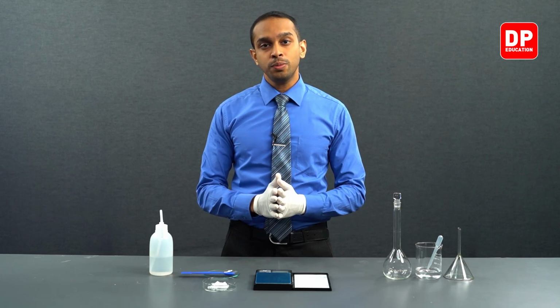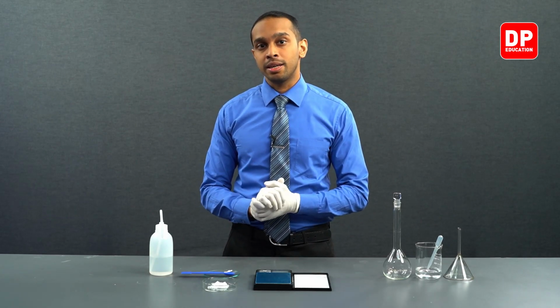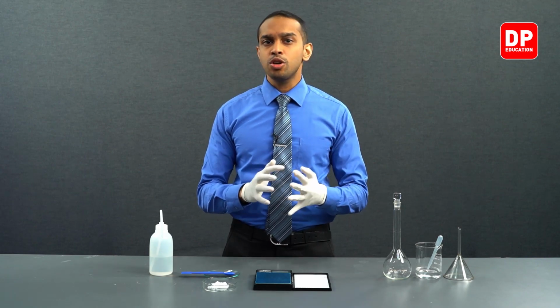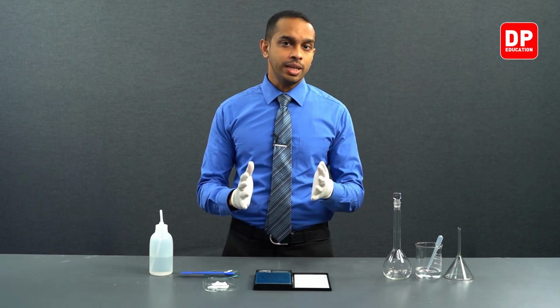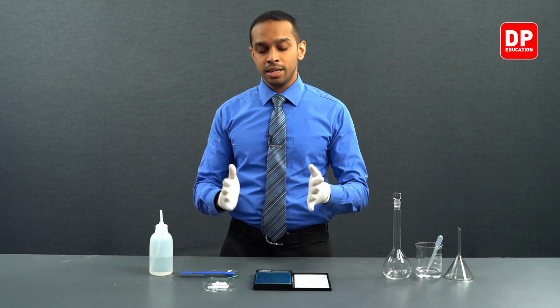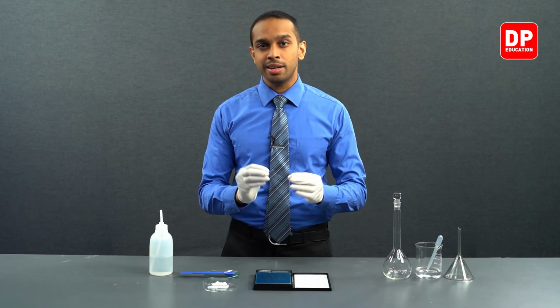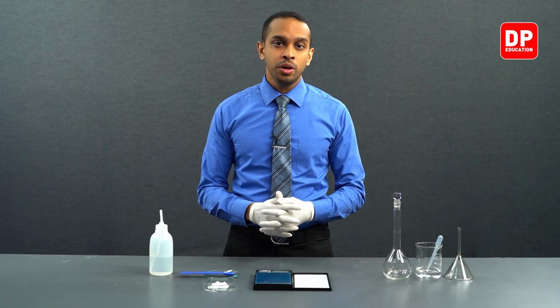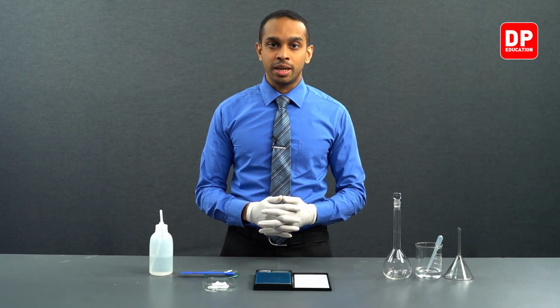As you may know, potassium permanganate is not considered a primary standard. Why is it not considered a primary standard solution? Mainly, potassium permanganate is not obtained in a very pure form. It contains a little bit of impurities, which takes away from the quality of a primary standard.